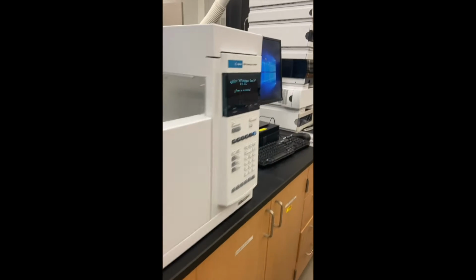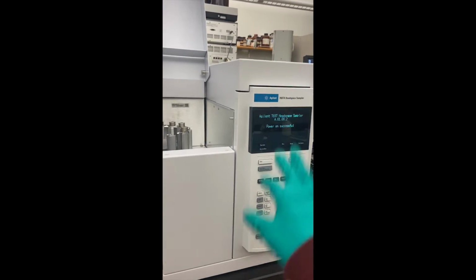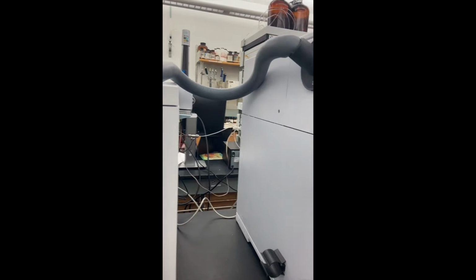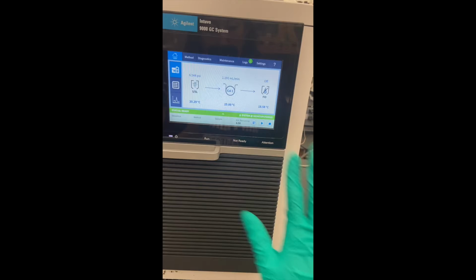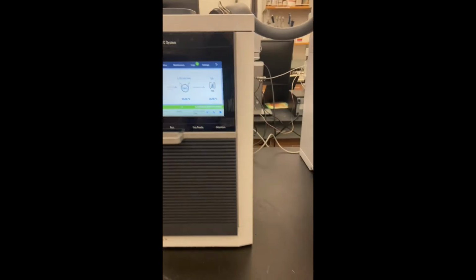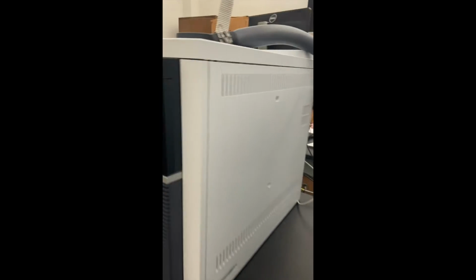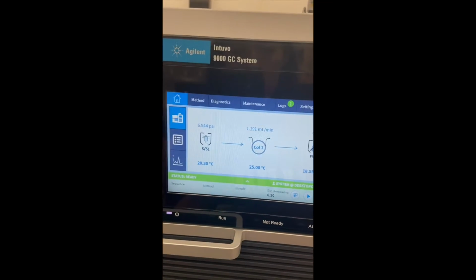Okay. So for your reports, the only thing you need to hit on in regards to instruments is your headspace sampler. And then we have our transfer line, which is an inert wax capillary. That's where gas travels into our GC system. And then you would go into explaining the column and our FID. Those are important components of this guy. Oh, and just to let you know, we are running this in splitless mode.